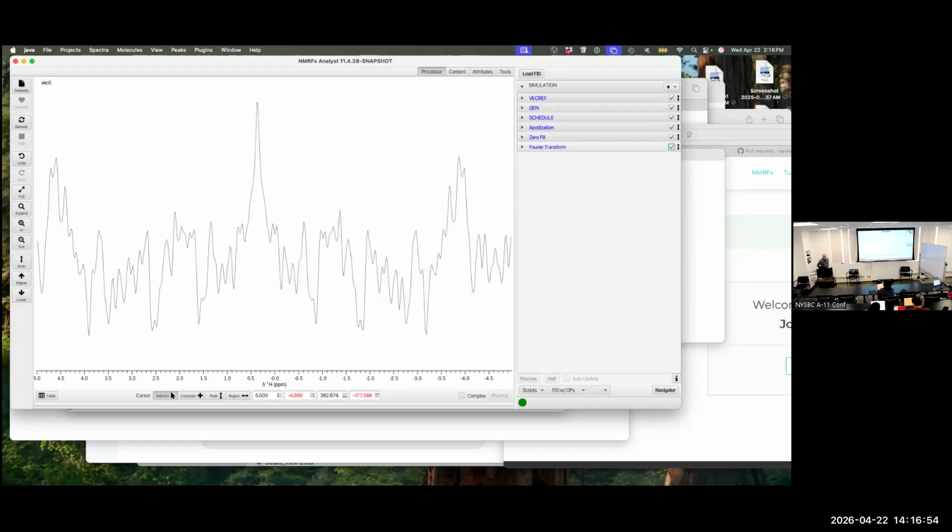But if I do that, what does my spectrum look like? Not so good, okay? Why does it look like this? It looks effectively like I've increased the noise in the spectrum. I go to this schedule here. On this sample, I'm taking only 5% of the points.